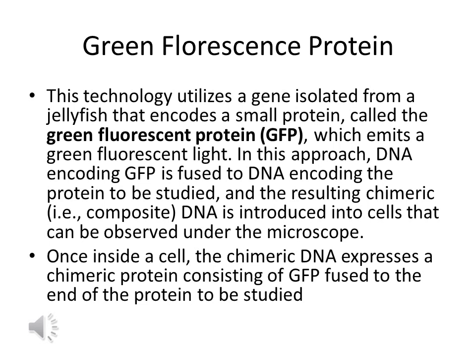That is, the protein produced there will fluoresce. The protein which gets expressed turns fluorescent green because it is now a chimeric protein fused with GFP. What we see in green in this figure is the endoplasmic reticulum. The protein which forms in the endoplasmic reticulum gets concentrated there. So the endoplasmic reticulum appears green because the chimeric protein, the fusion product of GFP and the targeted protein, is expressed abundantly in the endoplasmic reticulum.